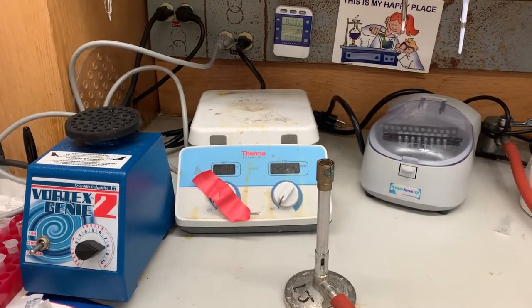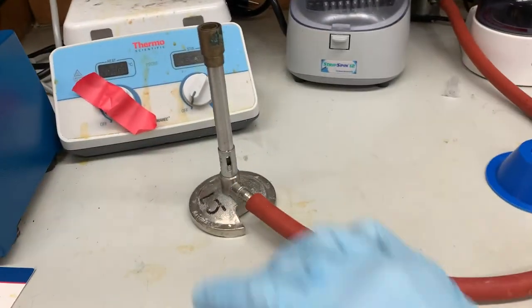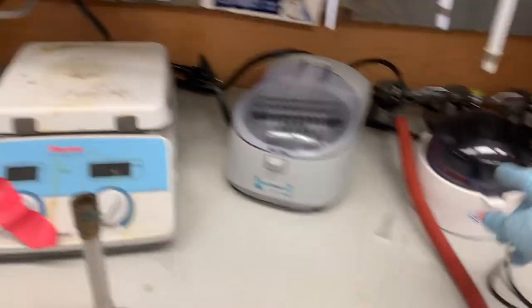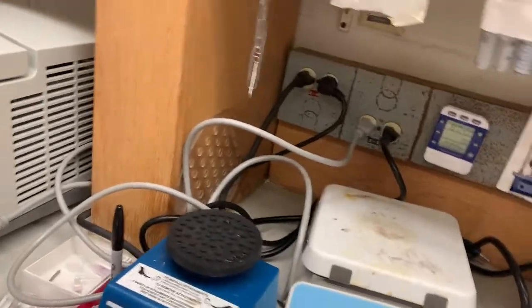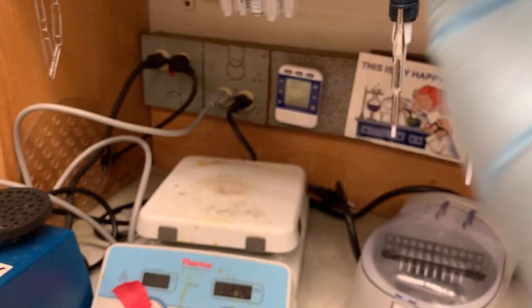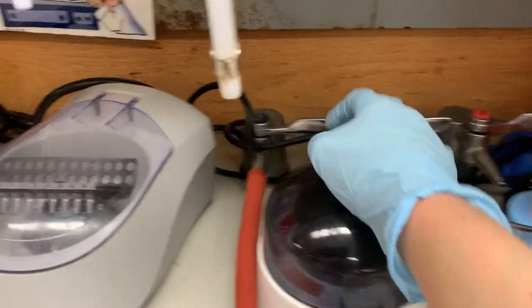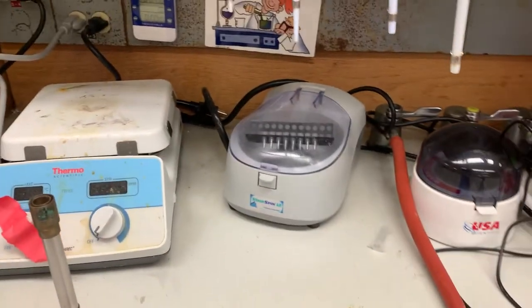You want to be really careful with anything that has to do with heat, flame, or fire. This is a Bunsen burner — it uses this striker and is connected to a gas line. You turn on the gas, strike it, and get a flame, but make sure there's nothing flammable in the area and you've cleared the space first. Next to the gas line is a vacuum line, and we can plug in a device for vacuum filtering — it sits on top of bottles with a filter and sections things through. There's also an air line, and if you're confused how these work, just line up the knob with the fitting and make sure you turn it off when done.